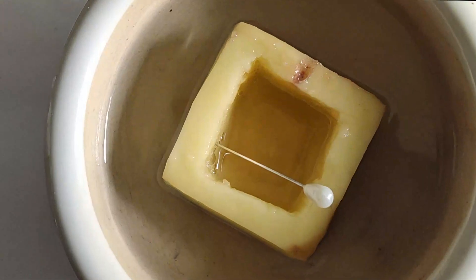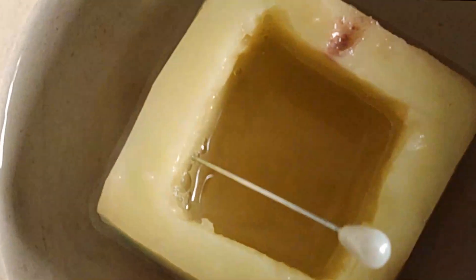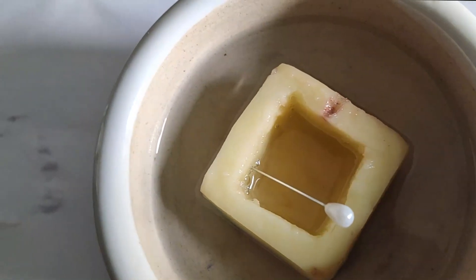Here, the water molecules present inside the potato represent a hypertonic solution, and outside the potato is a hypotonic solution. So, according to the law of osmosis, water molecules have to travel inside the potato.